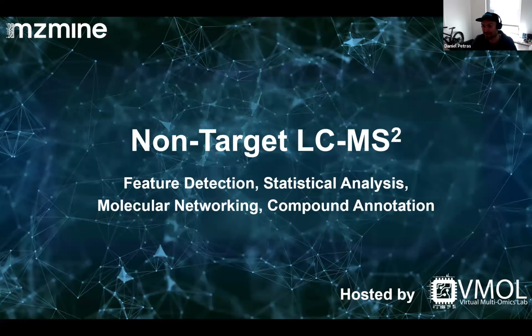It's my very great pleasure to have Robin, Ansgar, Corinna, and Steffen today here, who are all from the mzmine team. And we're going to kick off the mzmine season. So for the rest of the year, for consecutive seminars, they will walk us through the use of mzmine for feature finding, not only for LC-MS data, but also for some other data structures. And today Robin will kick off with non-targeted LC-MS/MS.